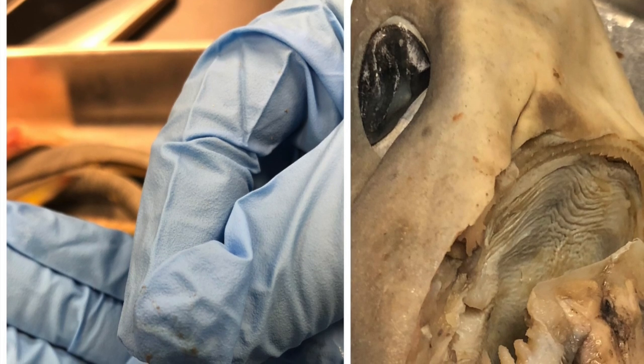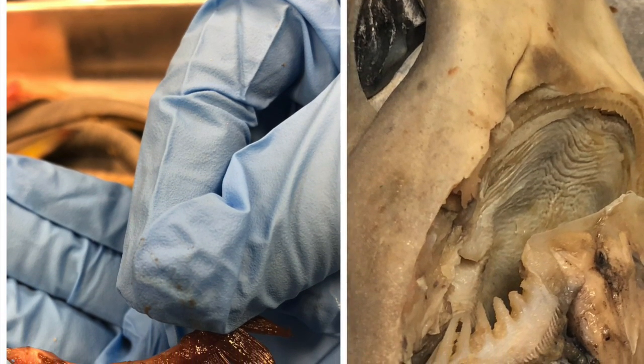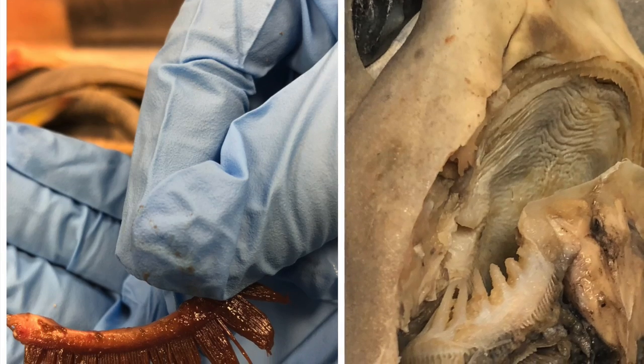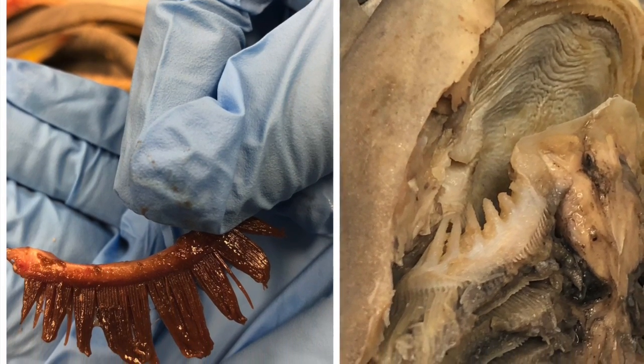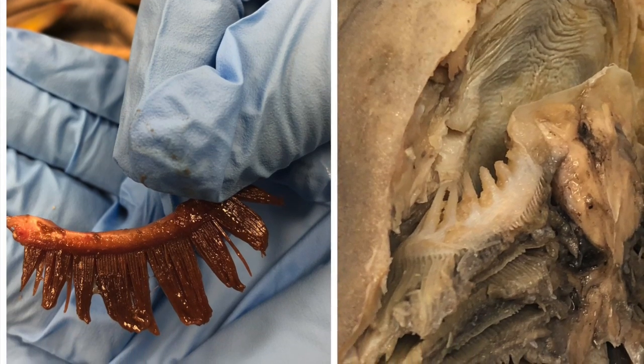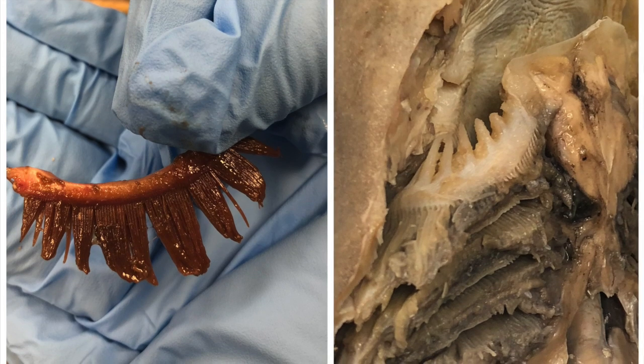Dogfish and ray-finned fish both have pectoral and pelvic fins, gill rakers which help filter debris from the water, and are jawed organisms. Gill filaments associated with gill rakers increase the surface area available for respiration. Although not shown, the pectoral and pelvic fins control pitch, the tilting up and down, and act as brakes. Both the dogfish and ray-finned fish have jaws, increasing the diversity of their diets.